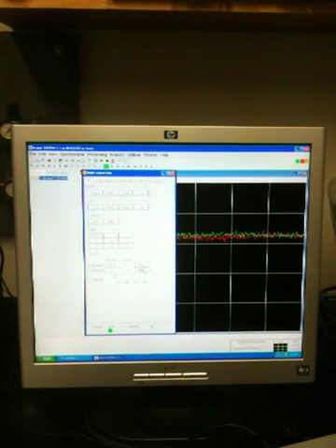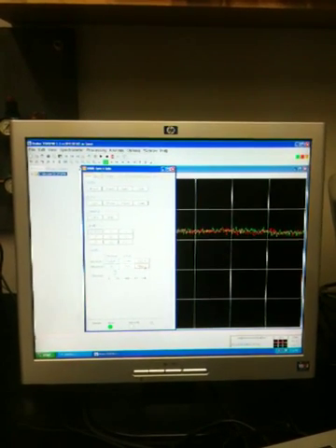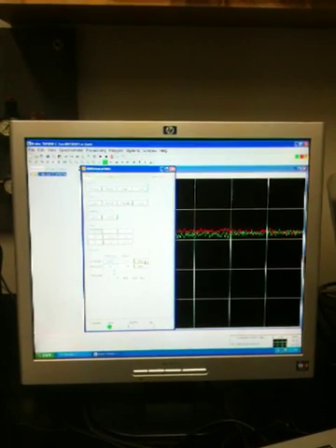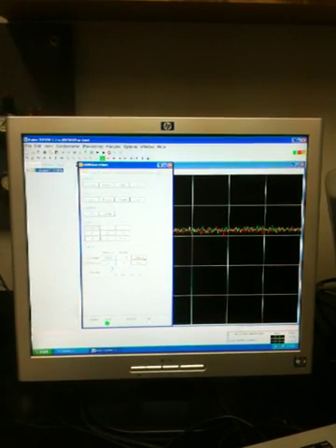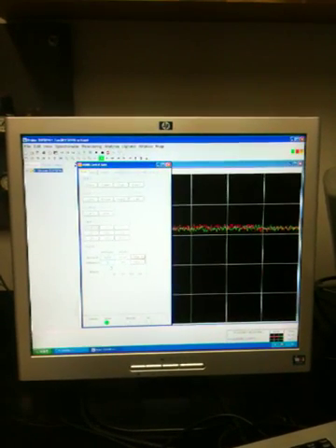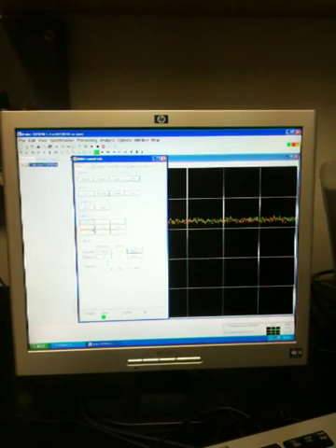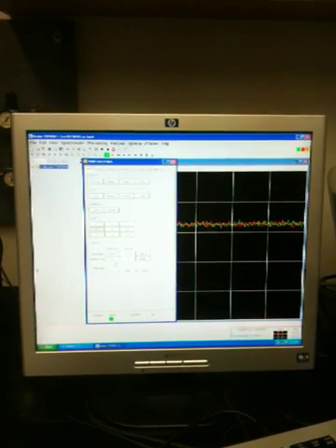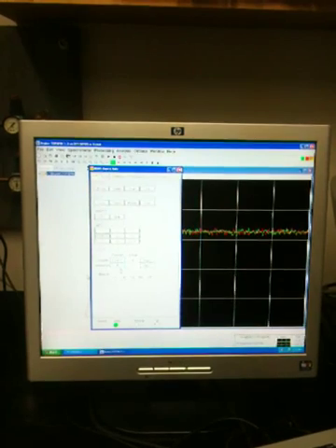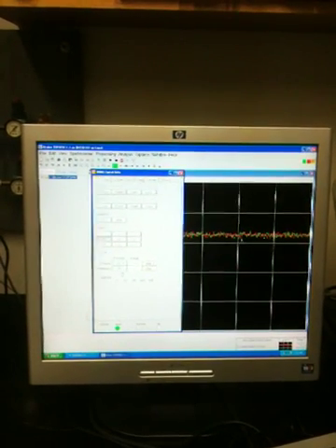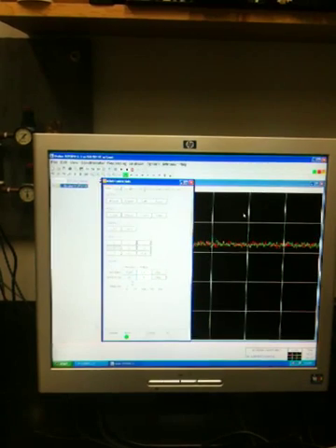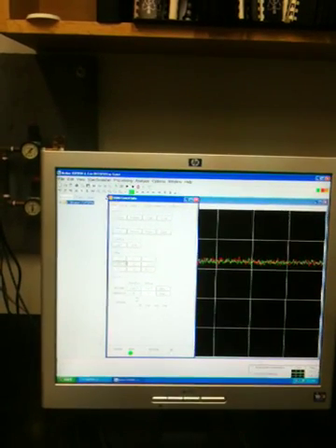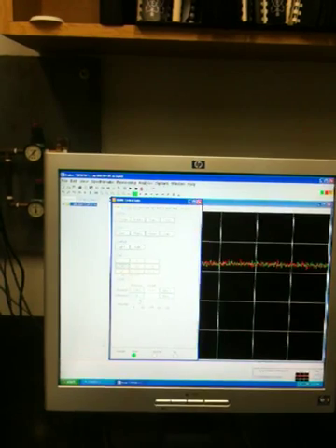I want to get this signal as high as I can. You eventually reach a point where it doesn't improve anymore, which it just did. So you back up and bring it back up. You would do a similar process on Z squared. Usually, it doesn't change much. Use step plus and step minus to try to get that signal as high as you can. That's the goal.